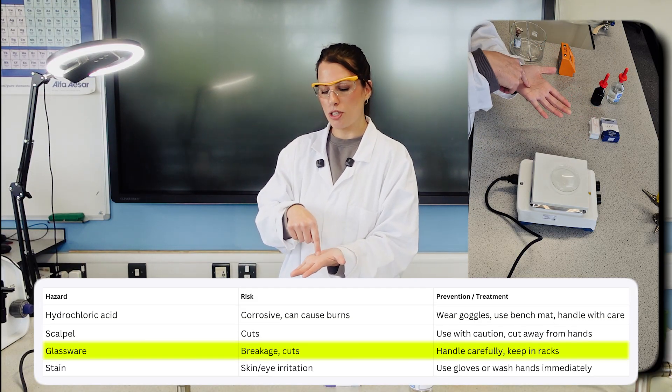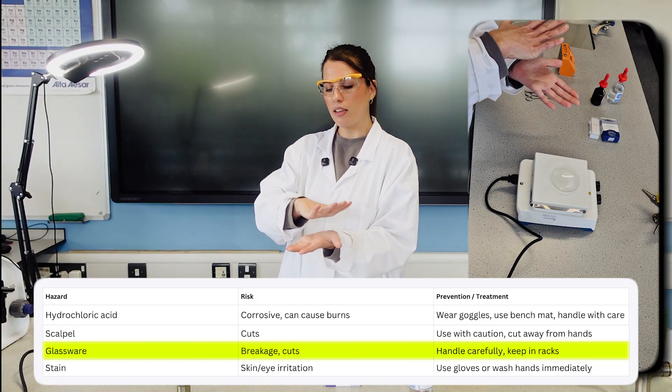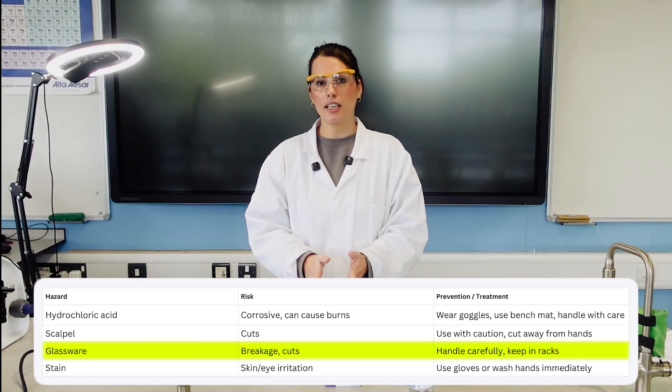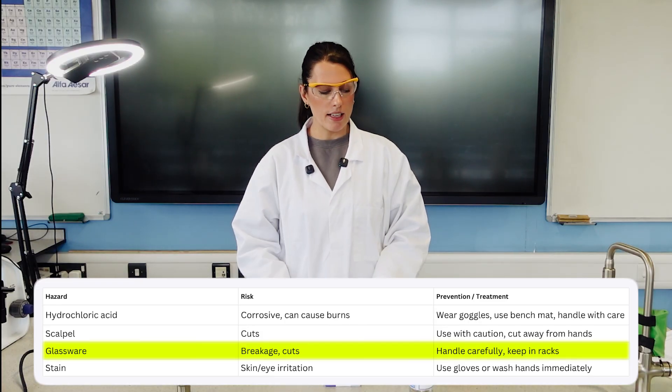Make students aware that they are very, very thin. If they push down too hard at one point rather than an even pressure across a larger surface area, it could snap and shatter the cover slip. I'll show you that when we get to that point as well.